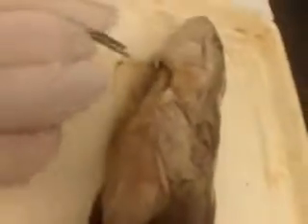Yeah, it's not. I think the levator hyoidus is just an extension of the levator hyomandibulae to the gill. So you can see the levator hyomandibulae, and part of it also connects to the gills. That's the levator hyoidus. It originates at the otic capsule, and it is inserted into the hyomandibular cartilage, and it also connects to the gill pouches, but a little downward, I think. It's not quite one you can really see.